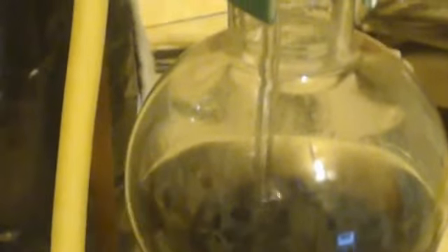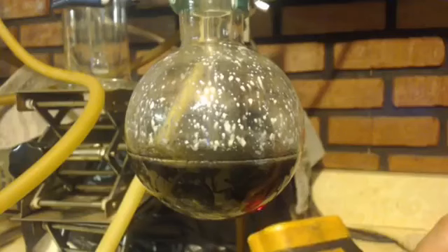while you're bubbling this stuff in. And at the very end, what I'm going to do is put a hot water bath on this pot right here, right? I'll put a hot water bath on that and let it reflux while I'm bubbling in the CO2, like the last 15, 20 minutes. I'll reflux it, maybe even a half hour, while I'm still bubbling in the last bit of CO2.